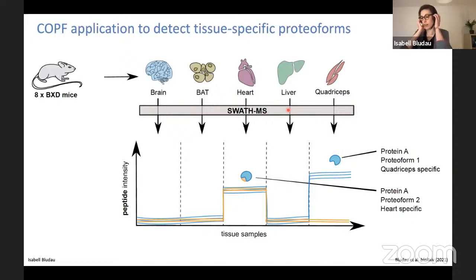I have not tried it with IEX, but from the data analysis point of view, it works for all kinds of separation techniques. Although the idea of using the molecular weight as an additional factor only works for separation techniques that actually involve the molecular weight of the complexes.